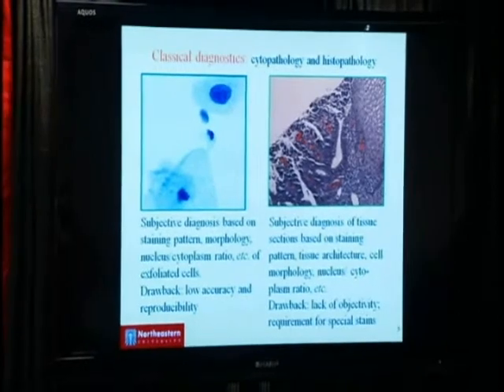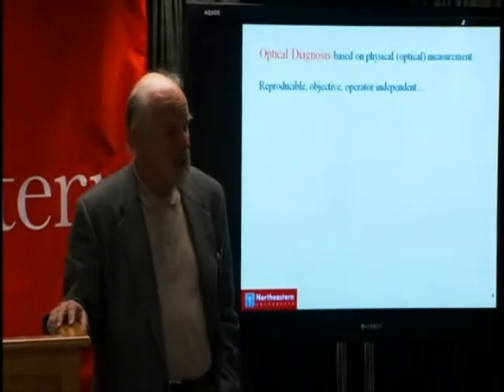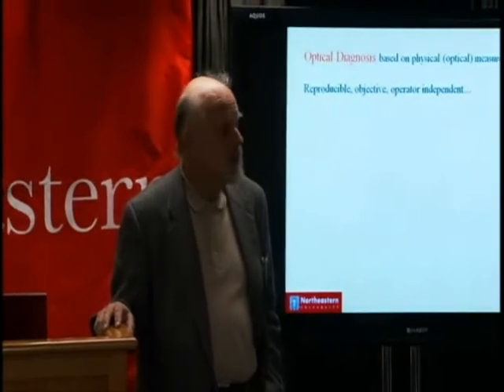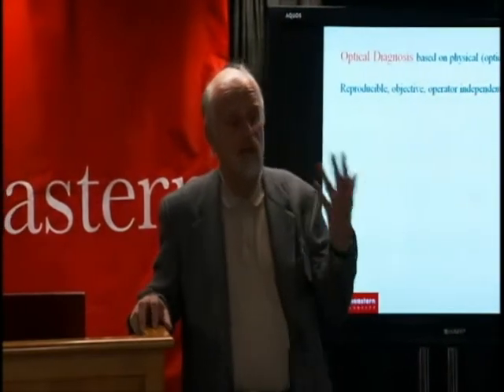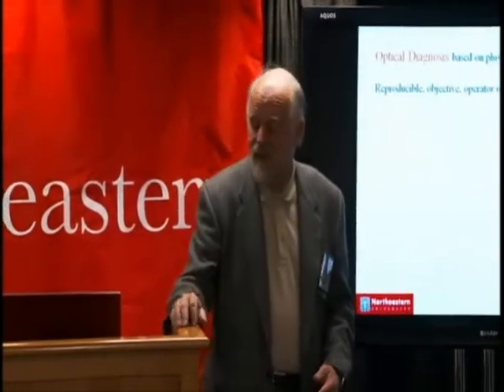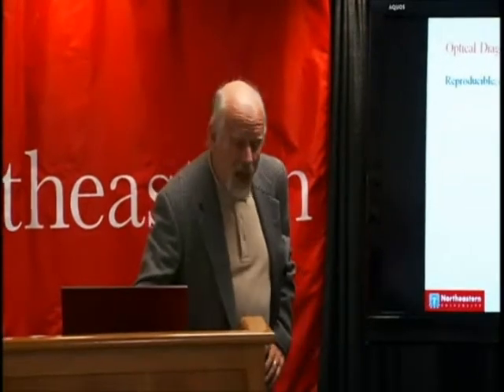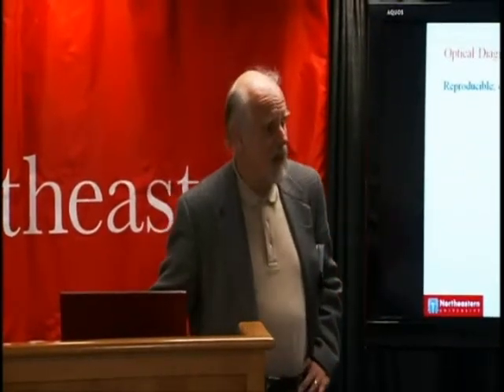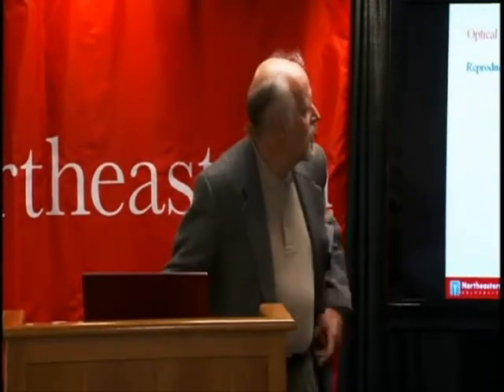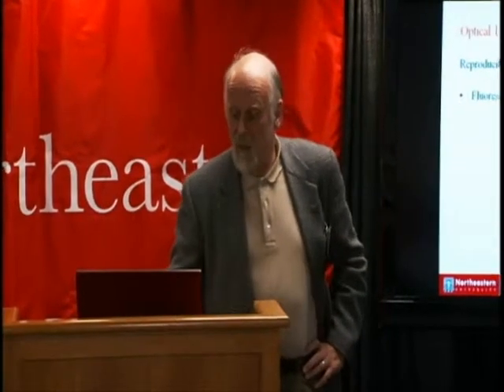In both of these methods, the diagnosis is subjective. It cannot be easily reproduced. If you give the same sample to 2 cytopathologists, you get very rarely the same result. And therefore, optical methods have been developed, and you have heard a number of them, to increase the reproducibility and be objective, operator independent, and so forth.